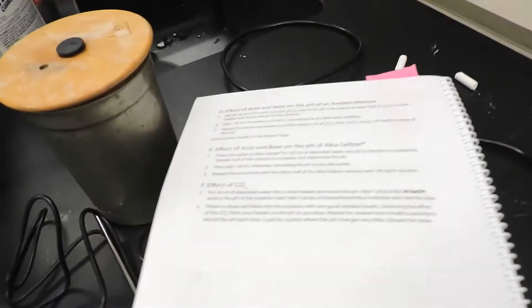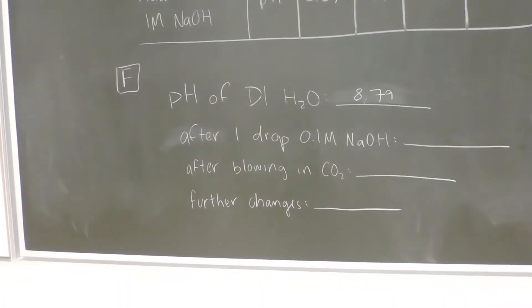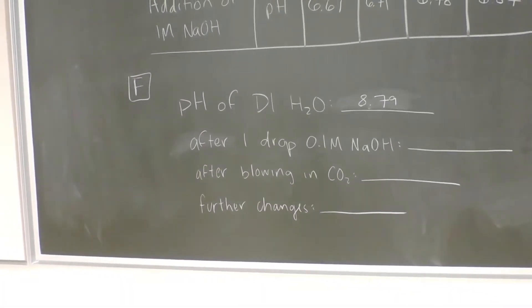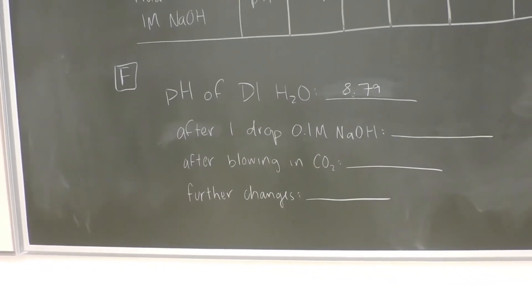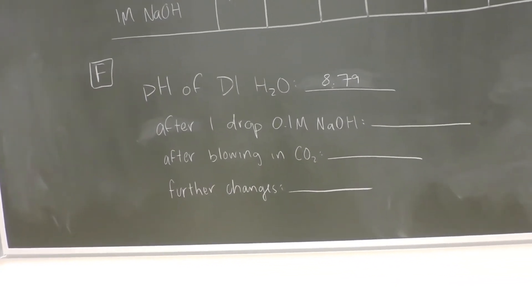Moving on to Part F, we're going to see the effect of CO2. For Part F, we're going to start off with 50 milliliters of DI water in a beaker, and the pH of this is 8.79.